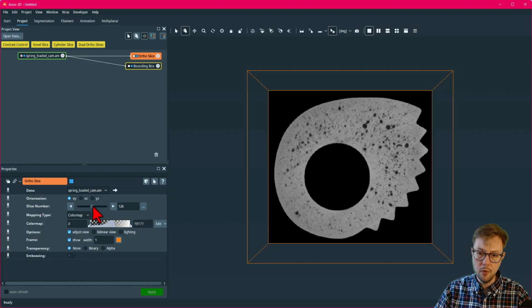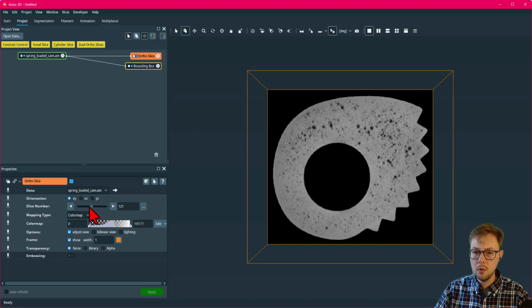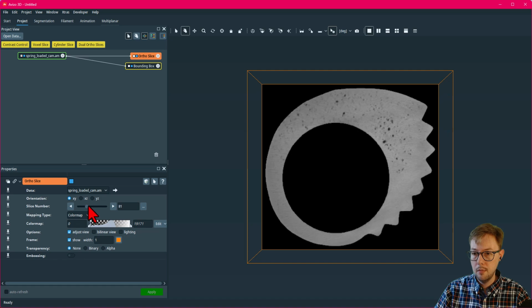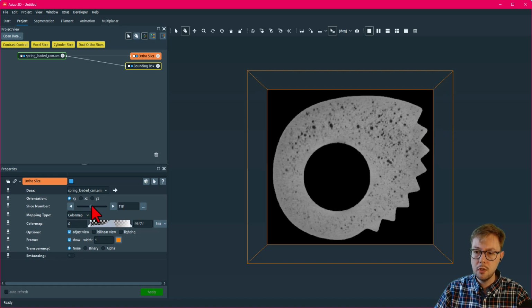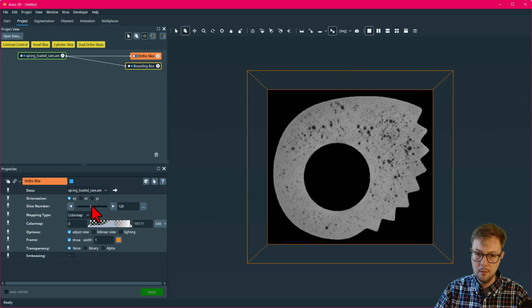The Slice Number port includes a slider that lets you quickly move up and down through the data stack with the corresponding change in the visual display. You may also use your mouse wheel if you hover over the selector or the text display of the slice number.